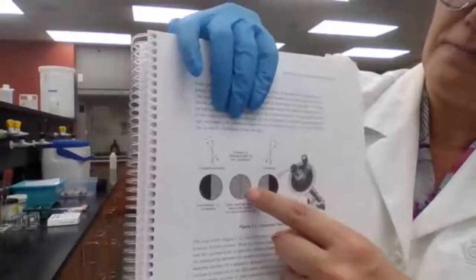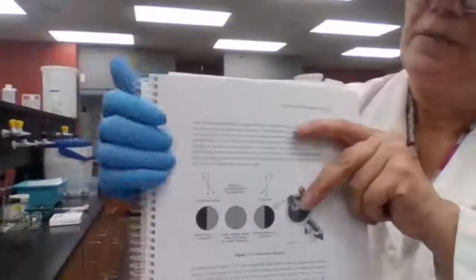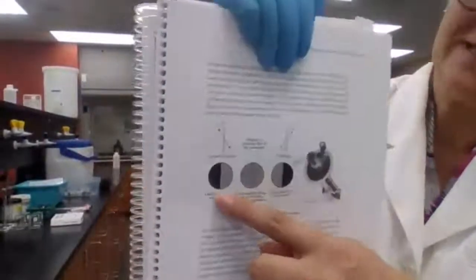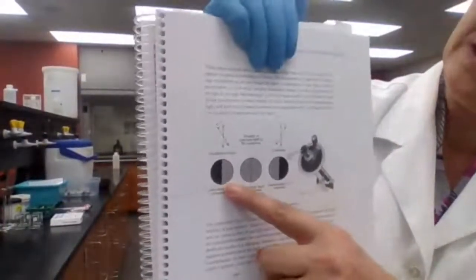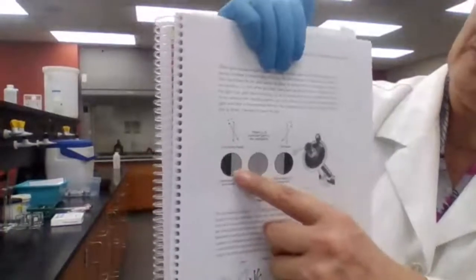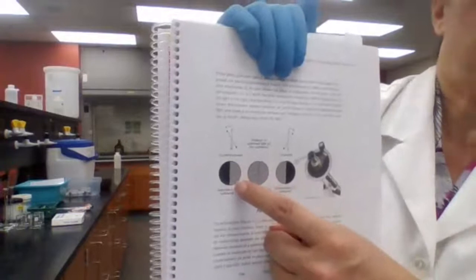I see the same shade. If the compound is chiral, it is going to rotate the light to the left side or to the right side, and I would see the rotation of the light, one side dark, one side light.